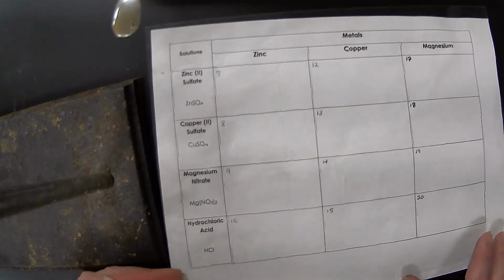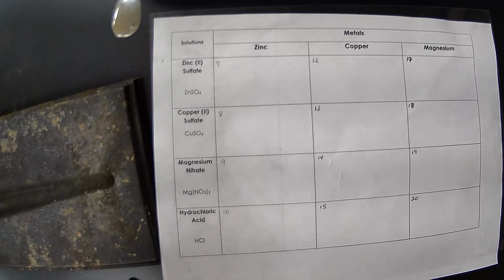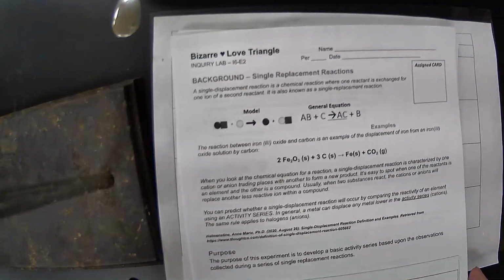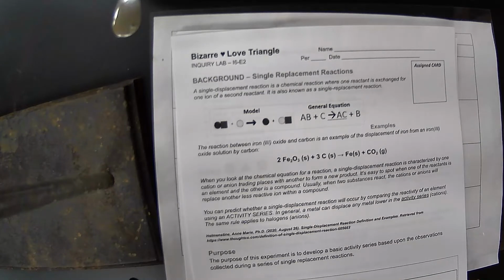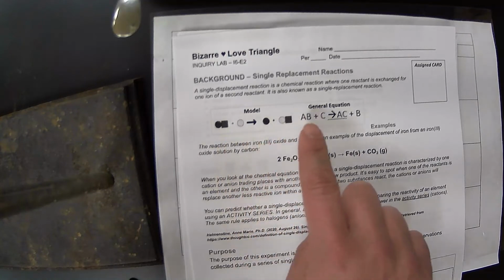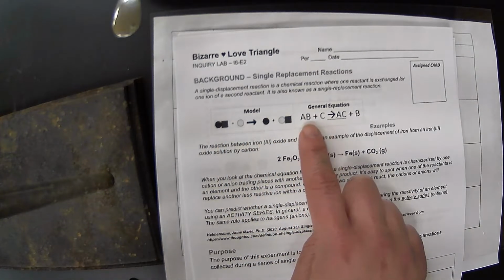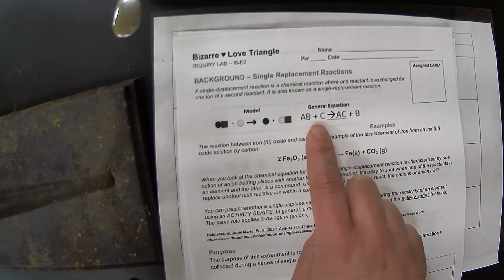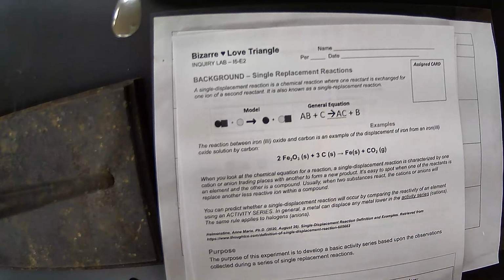All right, today we are looking at the single replacement reactions lab. To begin with, a single replacement reaction is a chemical reaction where one reactant is exchanged for one ion of a second reactant. It's also known as a single displacement reaction. So we have two general equations here, one shown in some pictures, and then our general reaction of compound AB plus C reacts to form compound AC plus B.